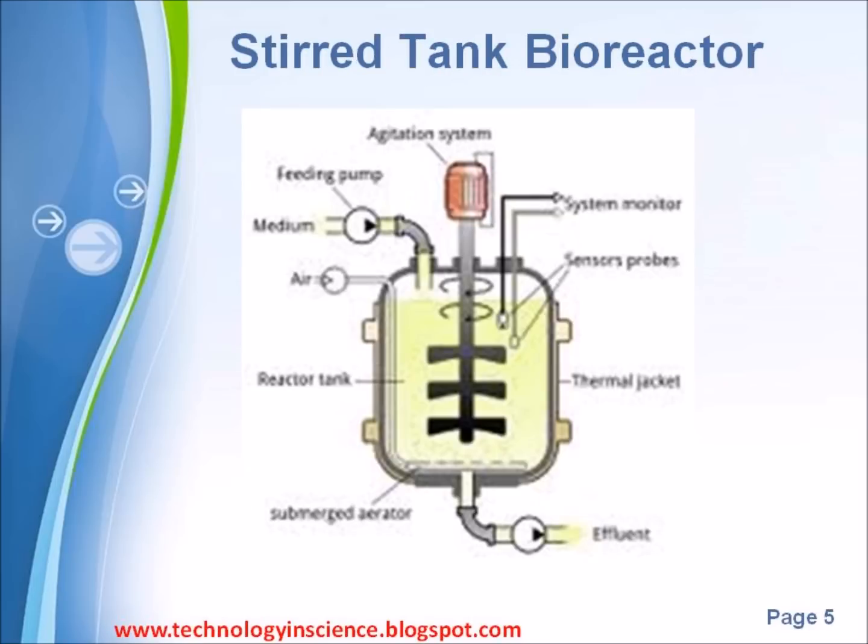Stirred tank bioreactor. In a stirred tank bioreactor, the contents of the vessel no longer vary with time. This applies to the hold-up of microorganisms and the concentration of the components of the medium in the fermenter. Steady-state conditions can be achieved by either chemostatic or turbidistatic principles.